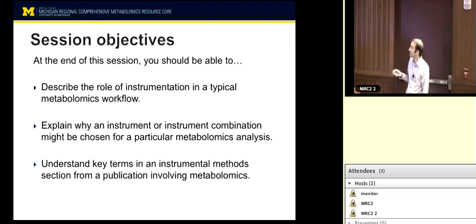Mass spec, we will definitely talk about methods overview. And then we'll look briefly at the instrumentation we have here at the MRC Squared. You'll get a chance to see some of that if you go for a lab tour tomorrow afternoon.